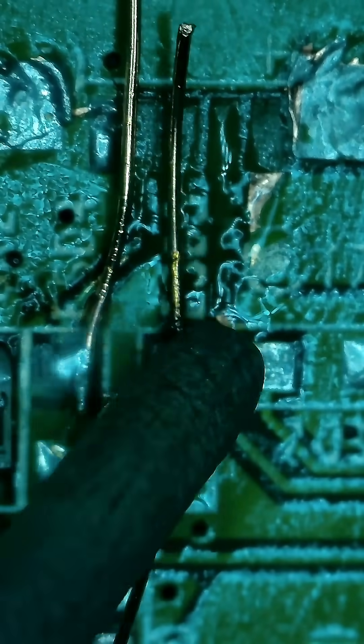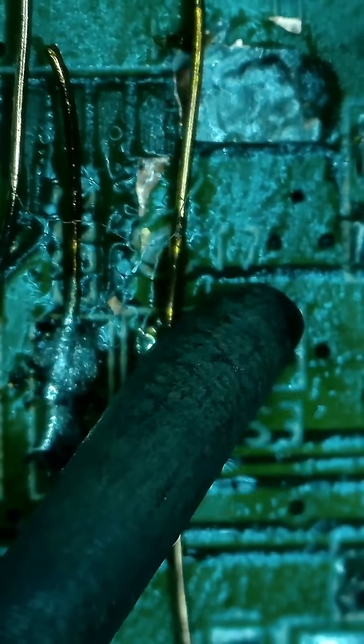Honestly, that went super good. I'm very inexperienced in doing trace repairs, so I was pretty proud of myself. Little did I know, that pride would not last long.